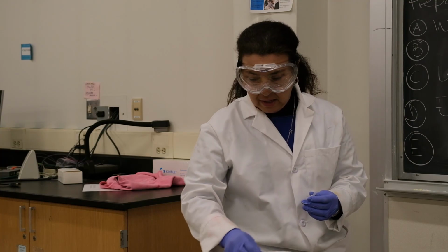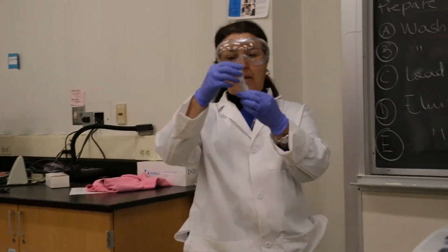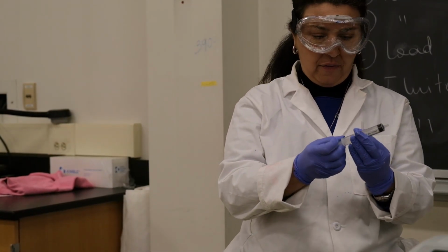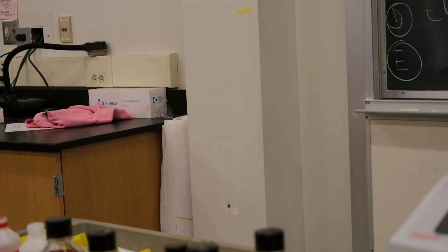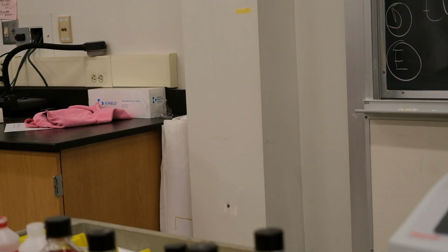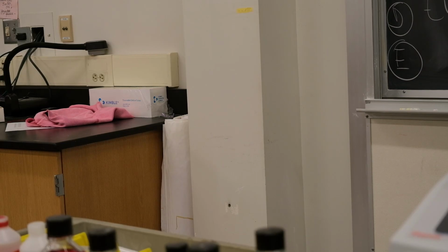Then what you do is you take the syringe, you have 10 milliliters. Let's say that I have 10 milliliters of the deionized water. So you mount first. Let's assume that you put your water in your container.